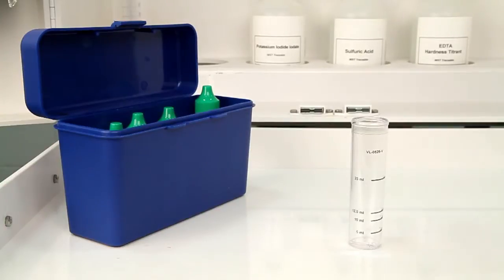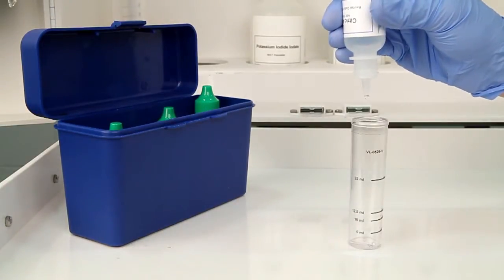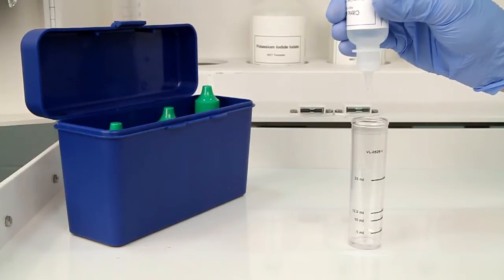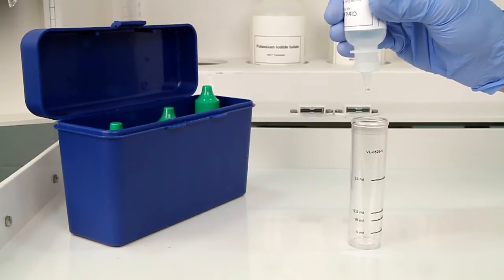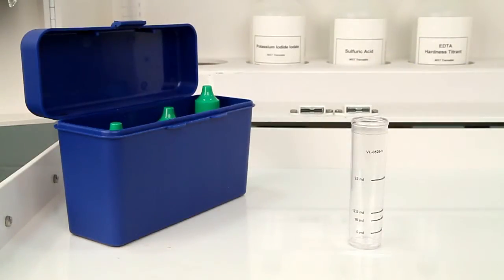Next, add 10 drops of citric acid. Hold the bottle vertically to get a consistent drop size. After the addition of each reagent, swirl the vial to make sure the reagents are properly mixed.